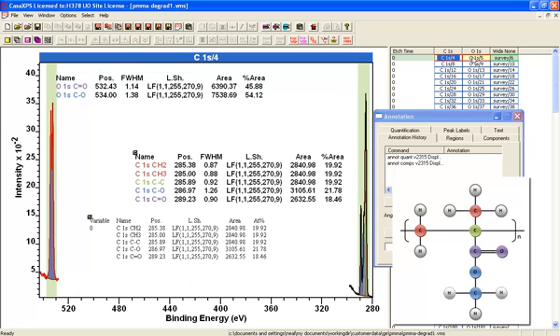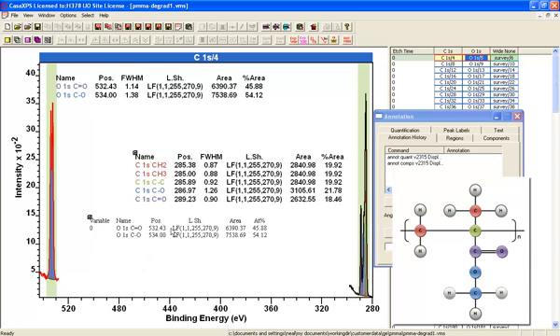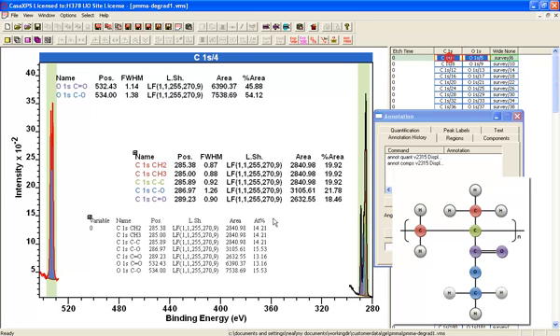On the other hand, if I select the oxygen and deselect the carbon, you can see just the oxygen results. And putting them together again, you get a quantification table that shows you the relationship in terms of atomic concentration based on the components in these two spectra.